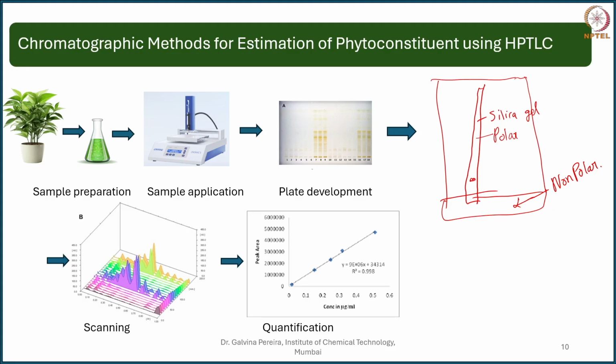Now what happens is if the ratio of these solvents changes, you are going to observe a change. When I have spotted my compound here and the solvent is running, based on its affinity for the stationary phase, it moves along as you can see here in this graph, and it will separate, with the most non-polar compounds at the top and the most polar compounds not running at all, and in-between polarity compounds coming out here. So imagine after running 50%, the mobile phase composition changes and the mobile phase suddenly becomes more polar or more non-polar.